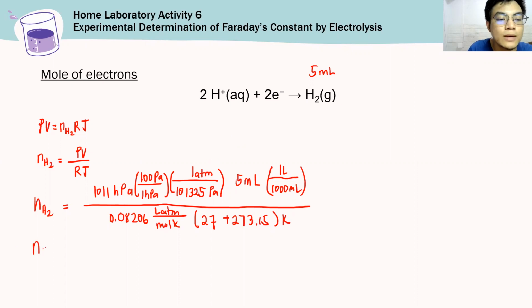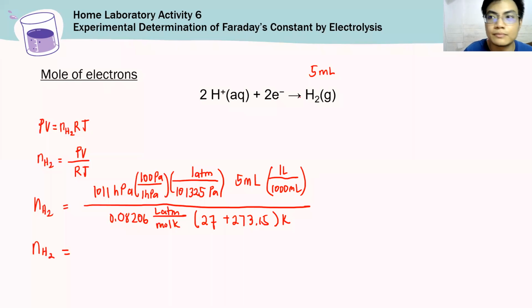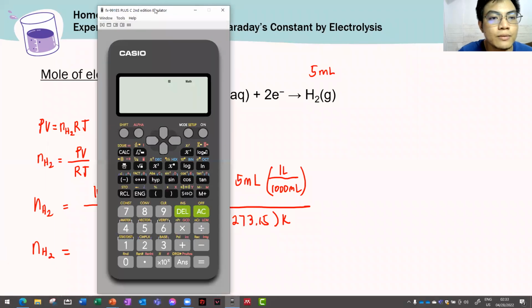Now to get the mole of hydrogen gas, you can just simply calculate for it. So let me use my calculator to solve for the mole of hydrogen gas.